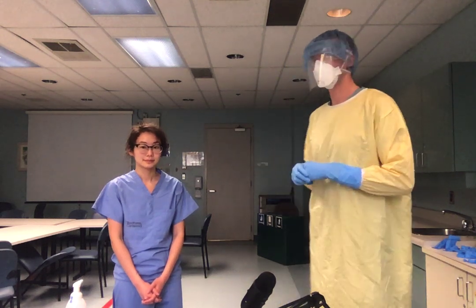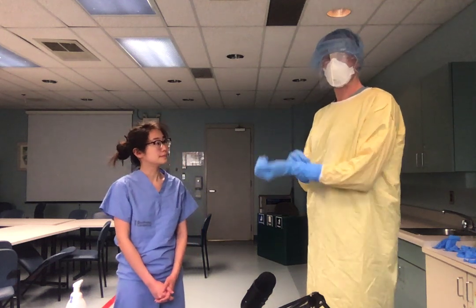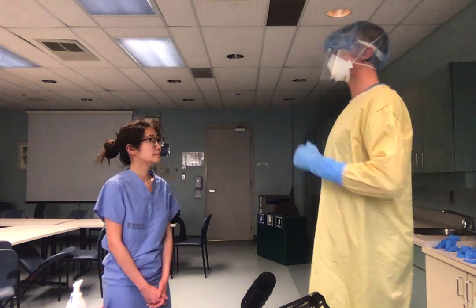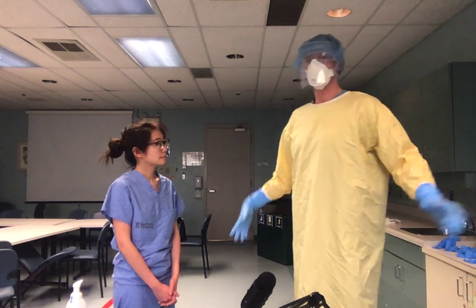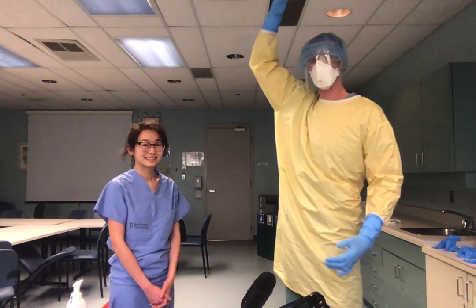And so the big thing that I think we need to pay attention to is taking our gloves off in the way that we were shown, okay? The gown, keeping that cue of eye contact so that you're not coming down here with your chin, you're reaching around, you're reaching up, getting the gown off. We're plucking our bouffant.